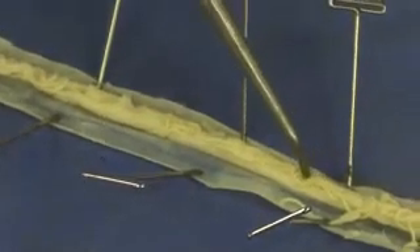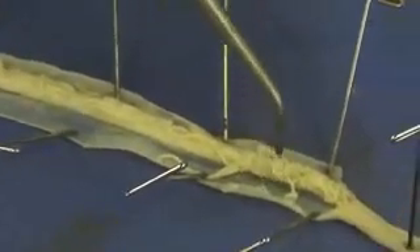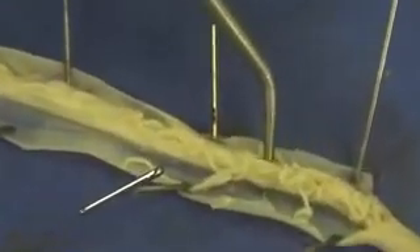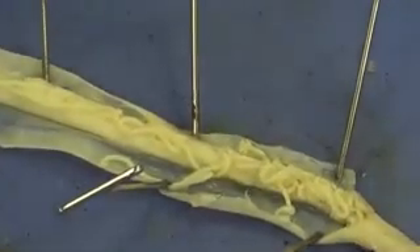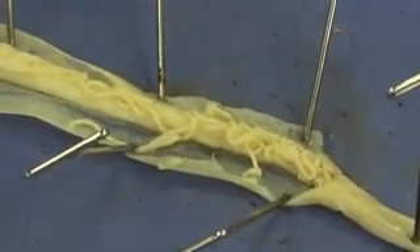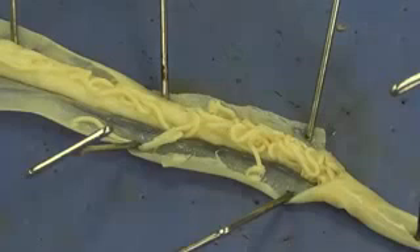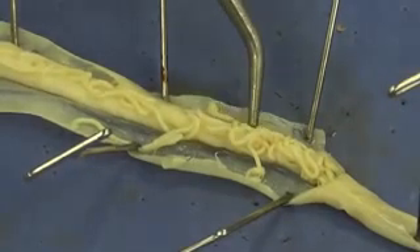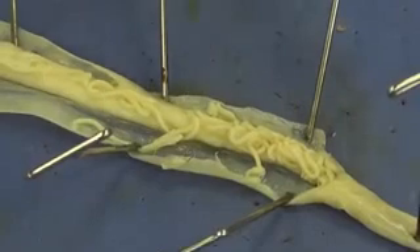You see a lot of the fine spaghetti-like structures that I'm pointing to here. These are all oviducts, and they will get smaller and smaller into hair-like structures, which are going to be the ovaries. That's where the egg is actually produced. The egg then travels through the oviducts, which are these larger spaghetti-like structures.